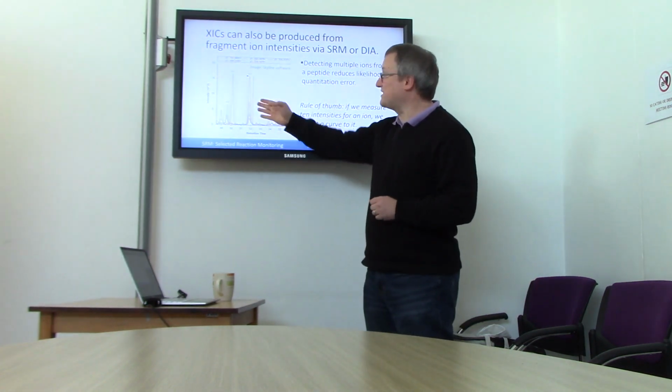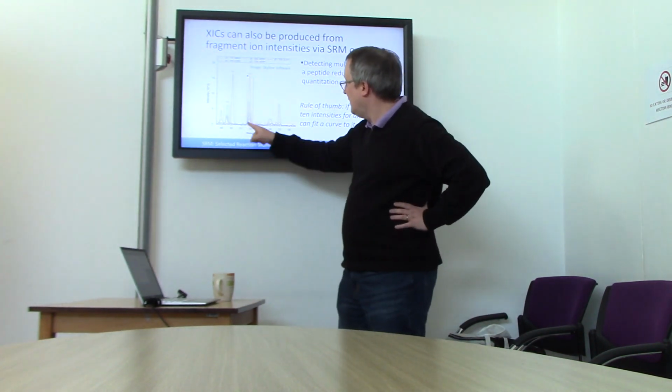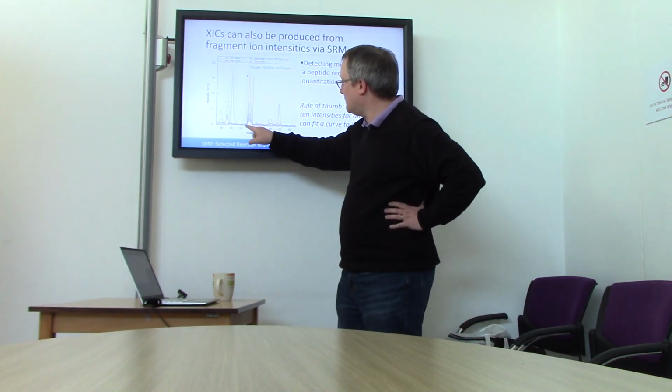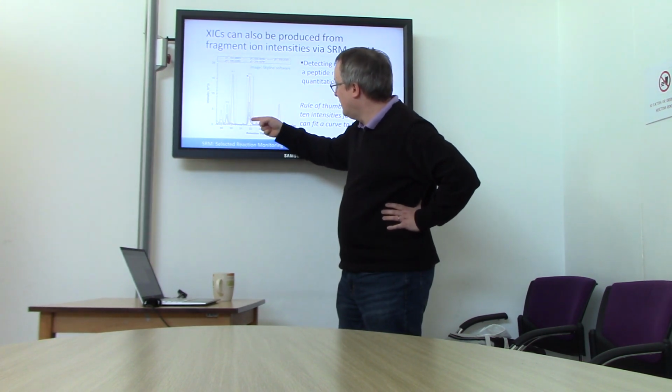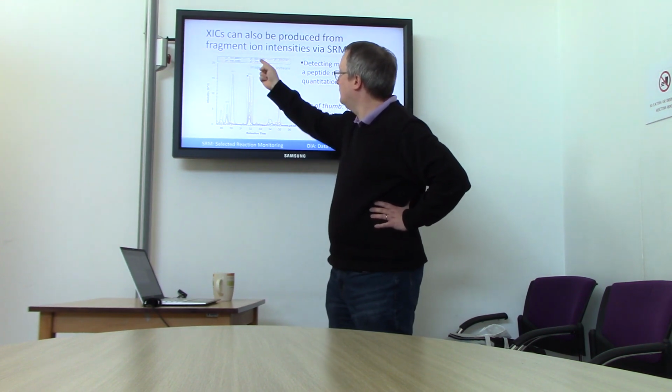So the software Skyline is really, really good at handling data of this sort. Here you can see that in this narrow range of retention times, we have, I guess, a burgundy, a lilac, a teal, a dark blue, and an orange. 1, 2, 3, 4, 5.